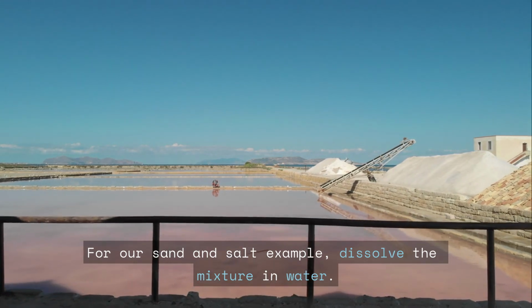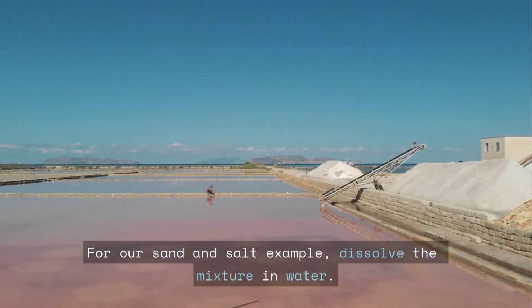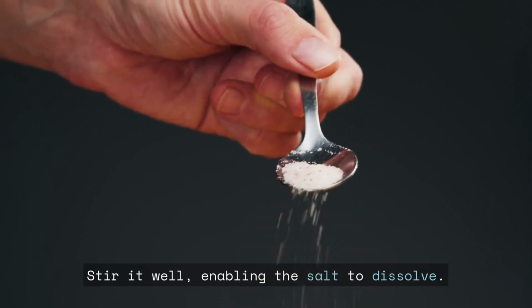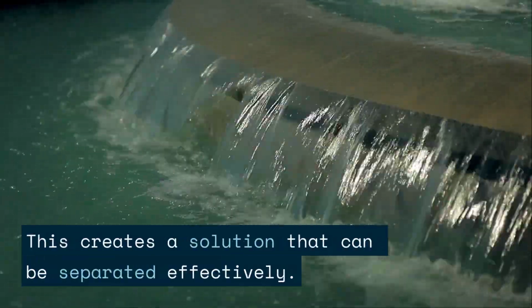For our sand and salt example, dissolve the mixture in water. Stir it well, enabling the salt to dissolve. This creates a solution that can be separated effectively.